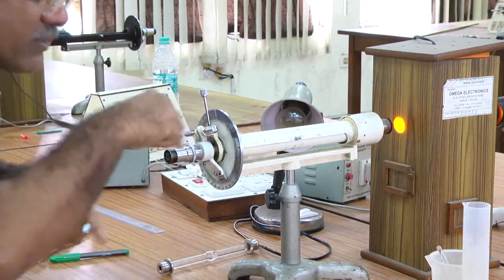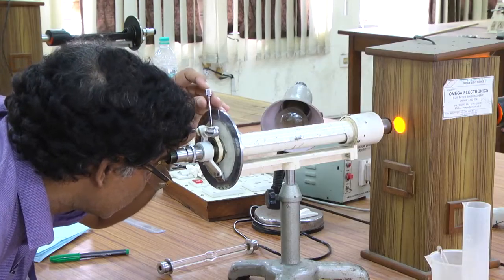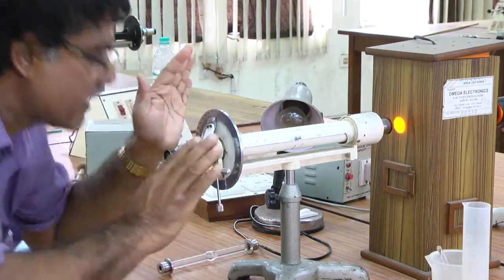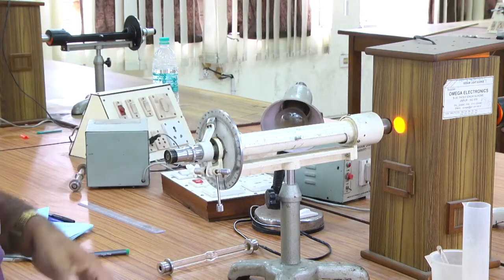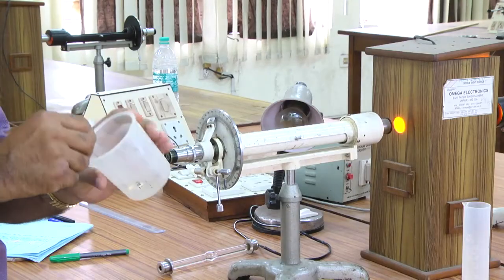So, you take this reading a few times, okay. At this position you can take it a few times, or rotate and take 2-3 times and take the average of that, okay.